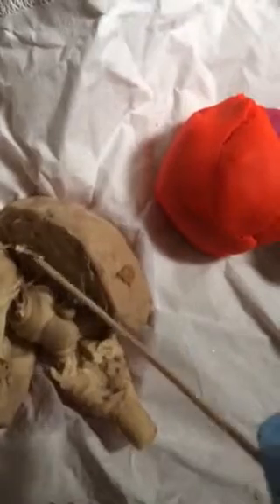Flip this back over. Open this up a little. You can see the lateral ventricle right here, and the corpus callosum, which is right in here. You can see more of that ventricle. This region to me looks like it may be the fornix.